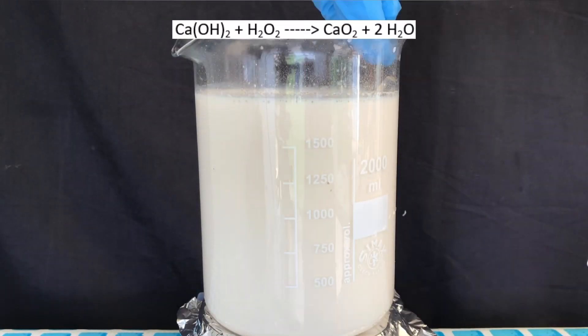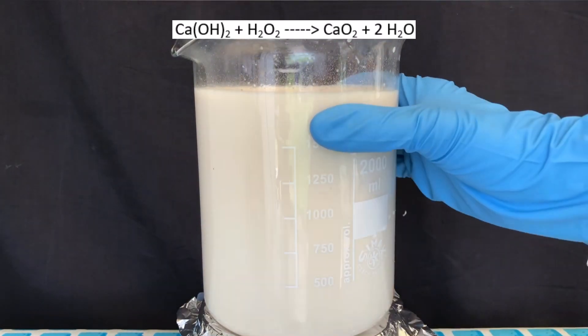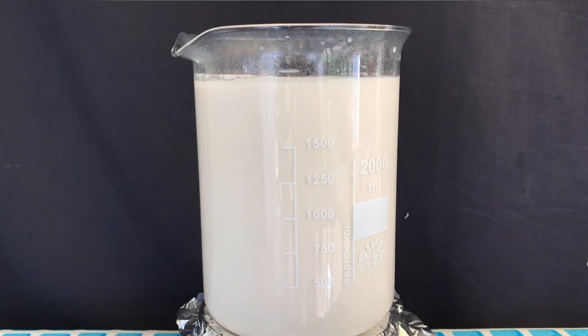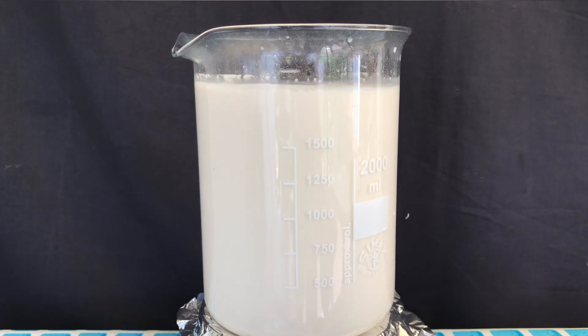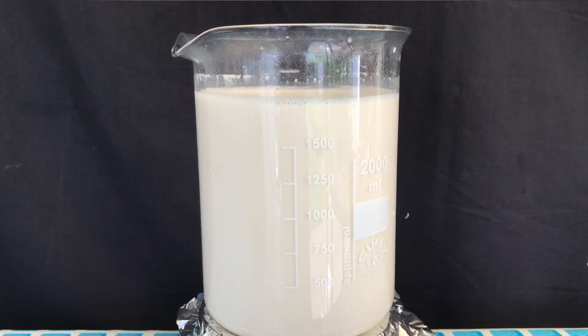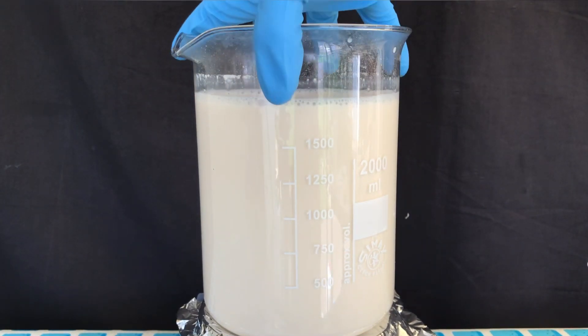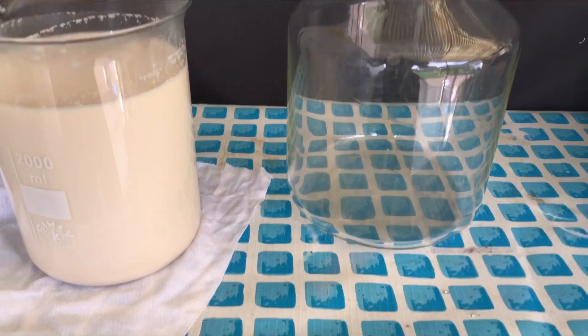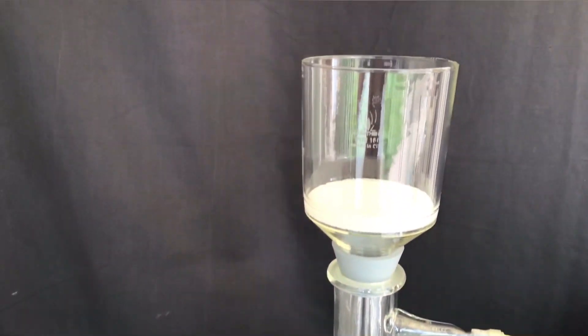By now, I haven't talked about the first step. The calcium hydroxide reacts with the hydrogen peroxide to form extremely insoluble calcium peroxide and water. To increase the purity of the product even further and because a lot of hydrogen peroxide has already decomposed, we added 250 milliliters of additional 11.9% hydrogen peroxide.